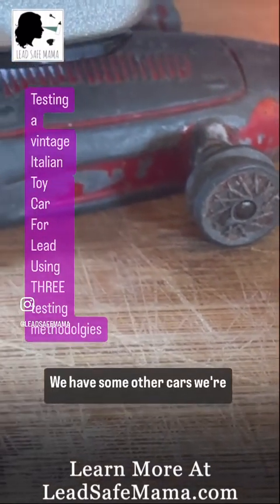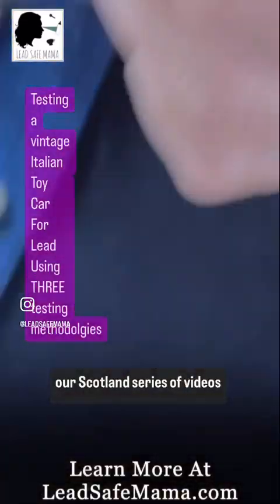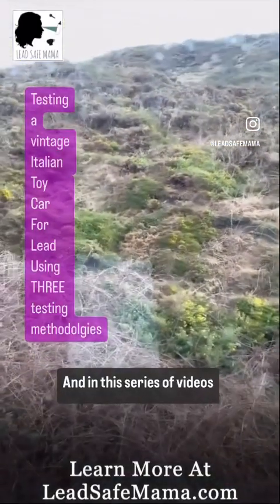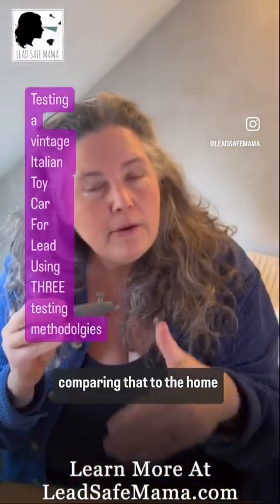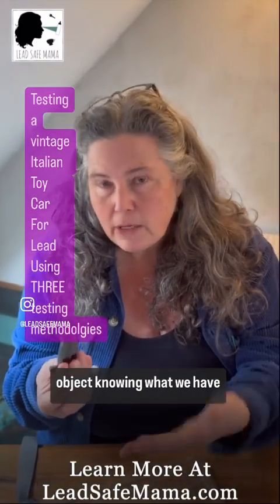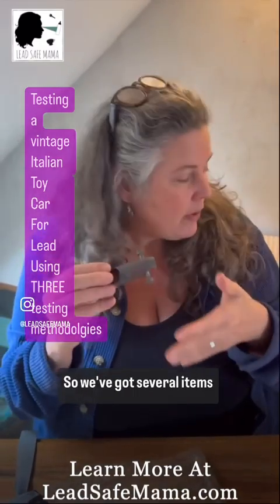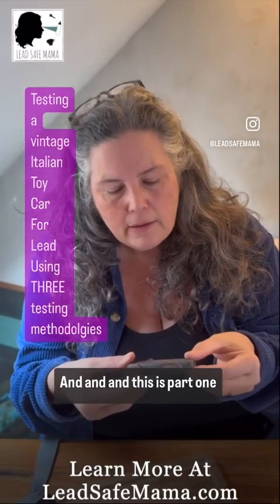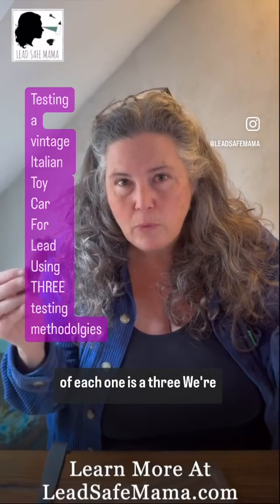We have some other cars we're going to be testing. So this is, again, part of our Scotland series of videos, since we have Scotland out the window. In this series of videos, we're going to be doing XRF testing of an object and comparing that to the home test kit testing of that same object, knowing what we have for the metals content of the object. So we've got several items that we're going to be doing follow-up testing on, and this is part one of a three-part series for each one.